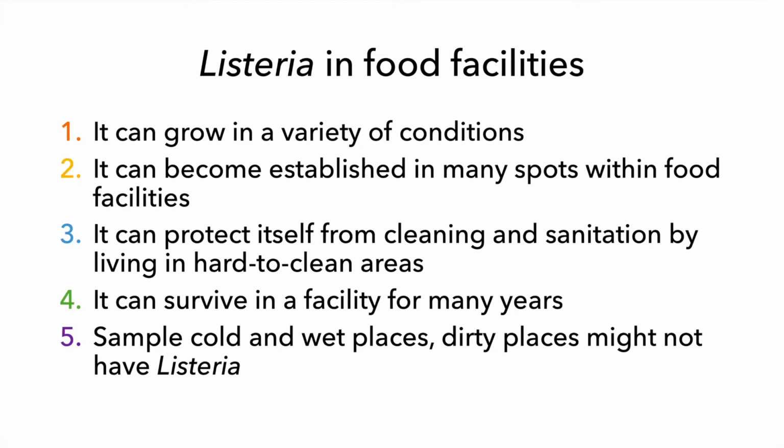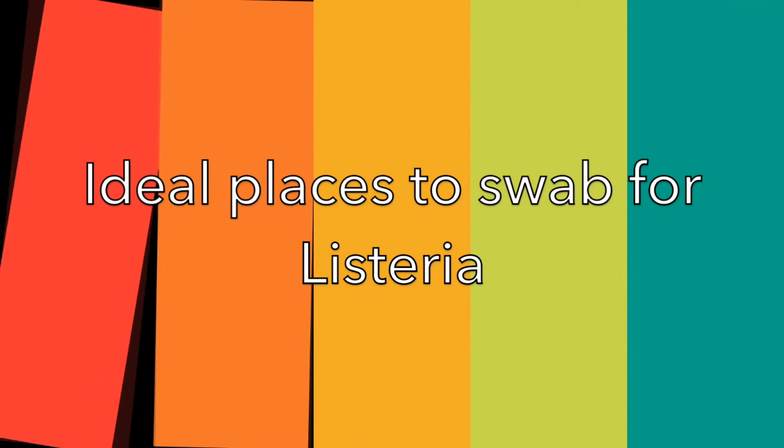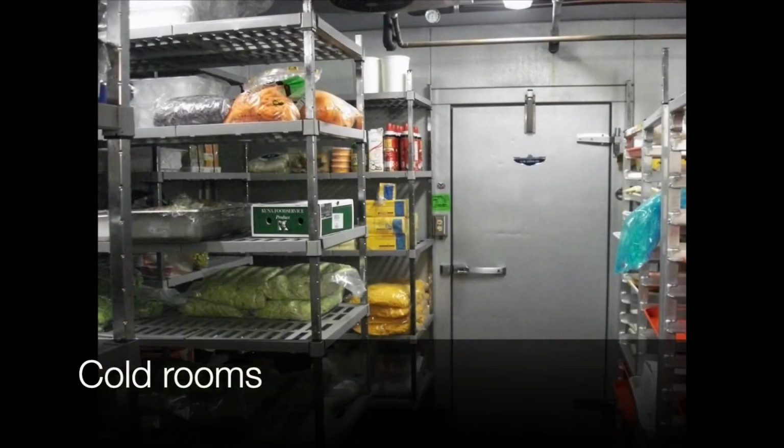Sampling should be done specifically in cold and wet places. Dirty places don't necessarily have Listeria, as other bacteria may outcompete it. So, where should you sample? Some ideal places to swab for Listeria include cold rooms.